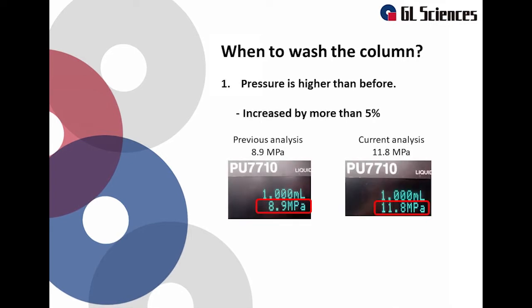The first case is when the pressure is more than 5% higher than previous analysis. When the pressure is high, it might be that the column is clogged. It is important to record the pressure of your new column under your analysis conditions. That way you can monitor pressure rises.